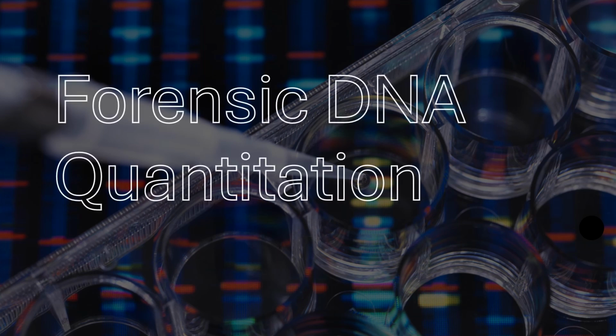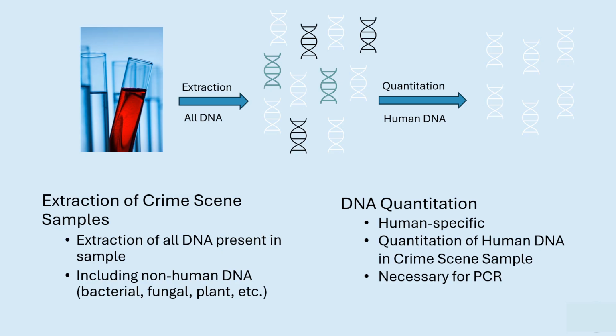Hello, and welcome to our presentation on forensic DNA quantitation, which is the third step in the DNA workflow. So we've extracted our DNA, and that's great, but we still have a few questions we need answered. First of all, we don't know how much DNA we actually have present in our sample, and of that DNA, we don't know how much of it comes from humans, and humans in a forensic setting are what we're interested in most of the time.